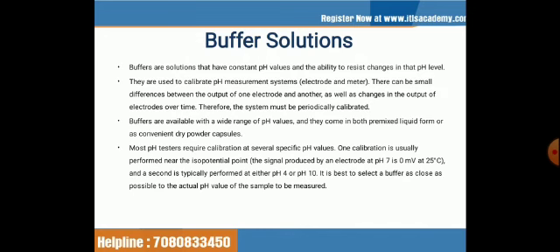What is the use of a buffer solution, or what is a buffer solution? Buffers are solutions that have a constant pH value and the ability to resist change in that pH level. They are used to calibrate pH measurement systems.